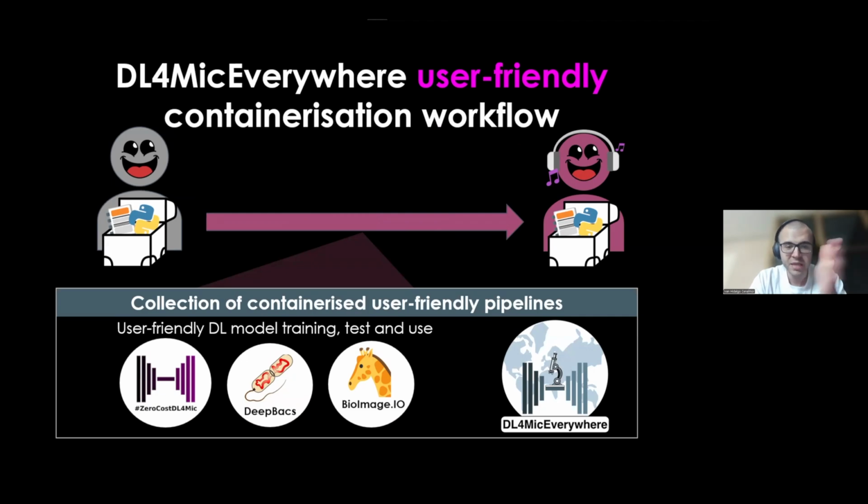You have all the notebooks from ZeroCost available, some custom notebooks from DeepBacs, and everything is really well connected to the BioImage Model Zoo, so that you can export your models, if the notebook has that feature, to the BioImage Model Zoo, or you can take them from there as tools.